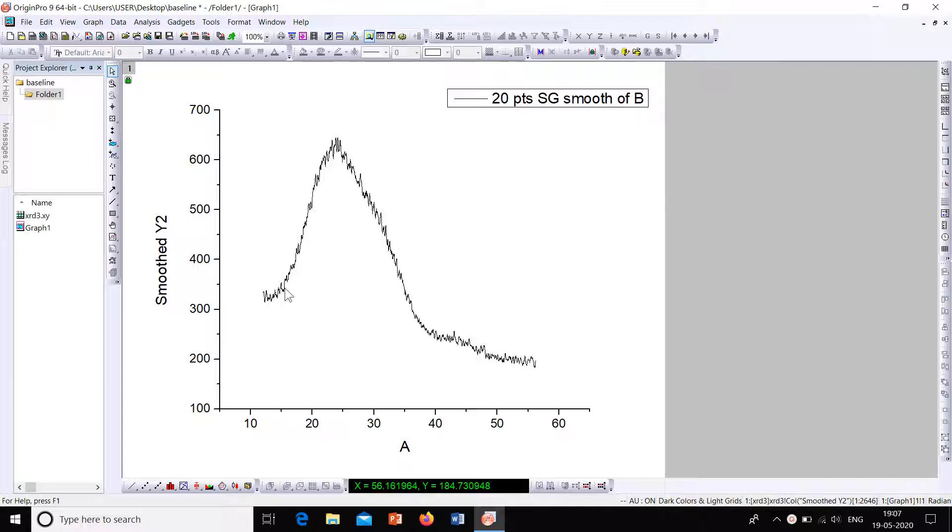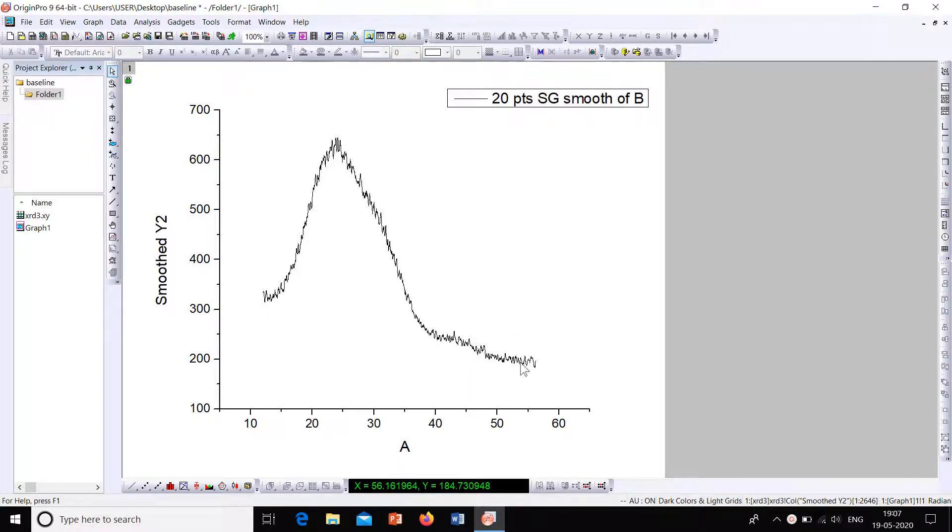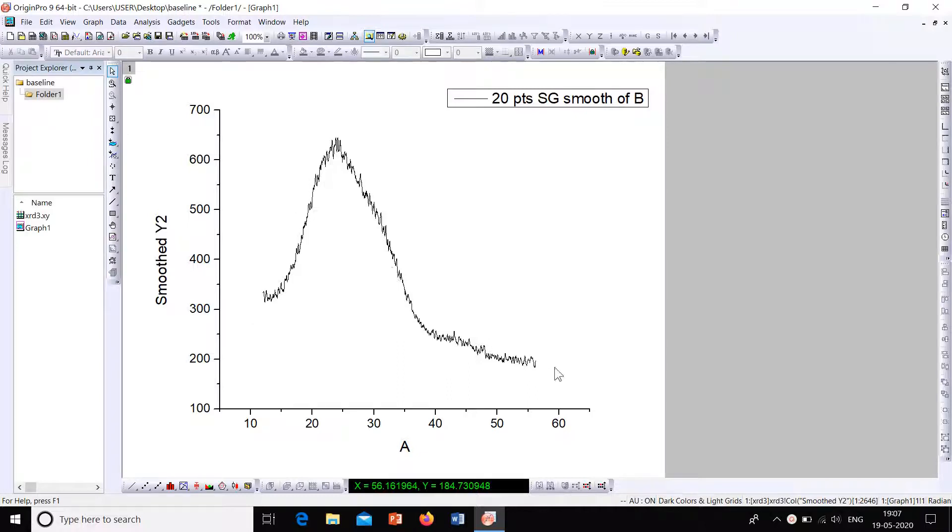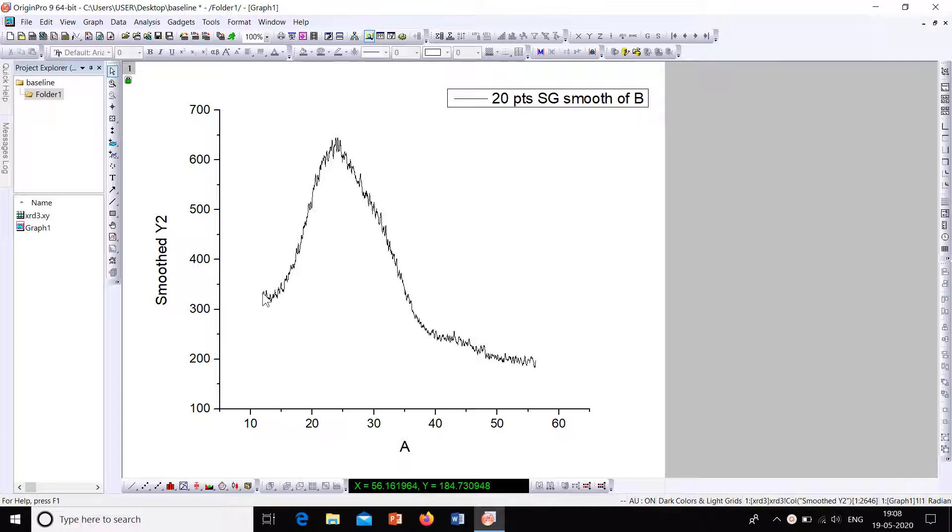Here I have selected a graph. This is an XRD plot. It is a part of an XRD plot where we need to correct the baseline. This plot is actually smoothed. You can refer to our previous videos to know how to smooth an XRD plot.